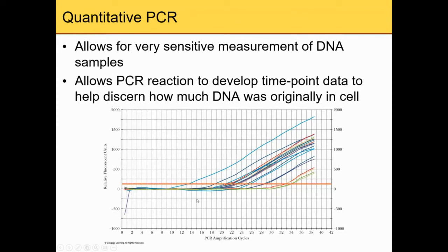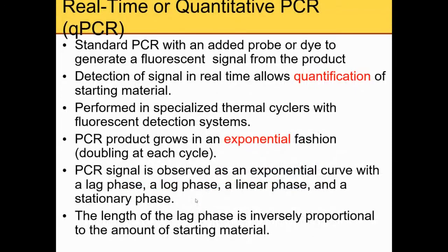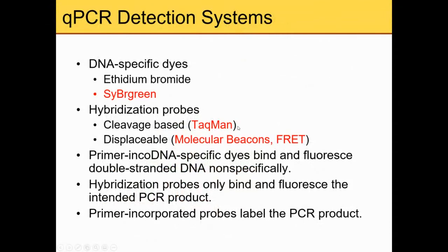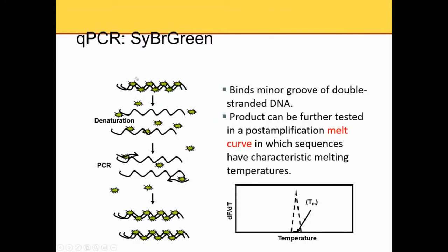Quantitative PCR requires the dye or the specific labeled probe so that you can evaluate the amount of specific DNA produced by the PCR. For the real-time PCR, it's qPCR, because you need to monitor the amount of DNA in real time. So you need to have a dye so that you will be able to evaluate, because you can use ethidium bromide, or SYBR Green.